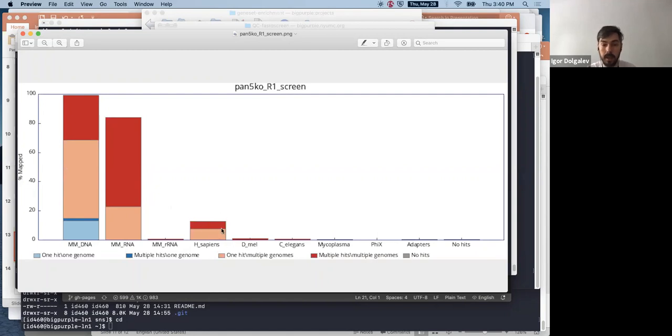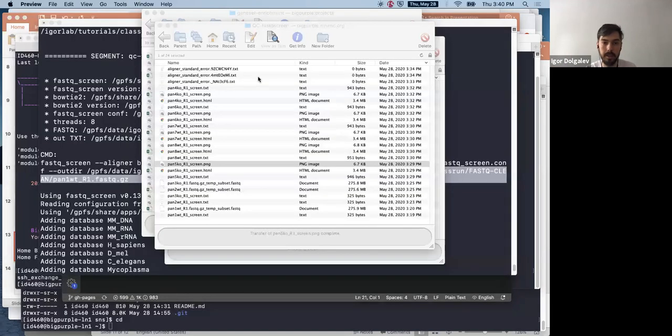So it's probably the reads that are homologous between your mouse and your human. And considering that it may be 10% of them, I think that's fairly reasonable that you would have 10% of your sequence be similar. Of course, especially because these are short reads, you don't have that much room to really be very accurate.